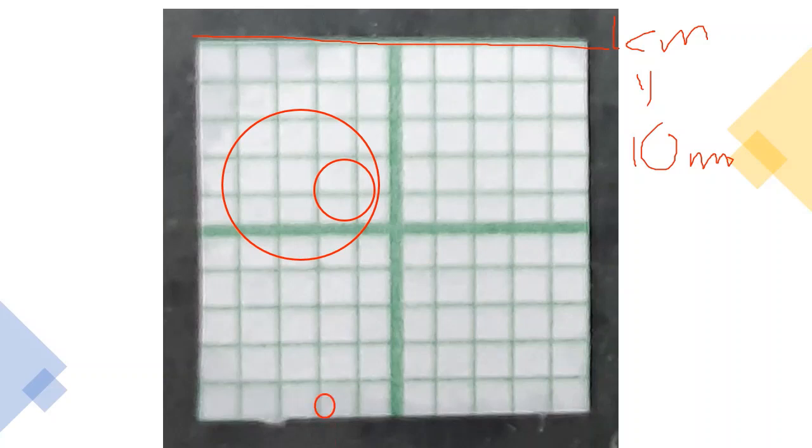And then at the higher magnification, we can get a diameter of around 1/3 of a mm, or around 0.33. So what we can say is that the higher the magnification that we have, the smaller the field of view that we have, by comparing the size or the measurement of the diameter that we have just now.